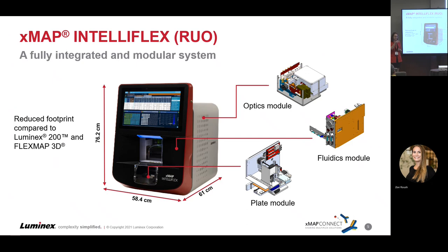With that reduced footprint, everything you see on this screen is everything you're having to deal with fitting onto your bench.